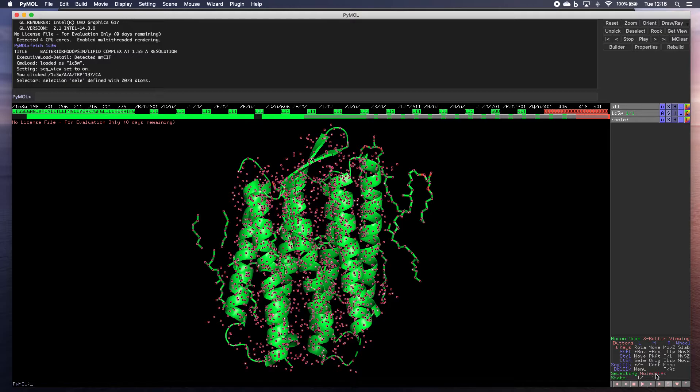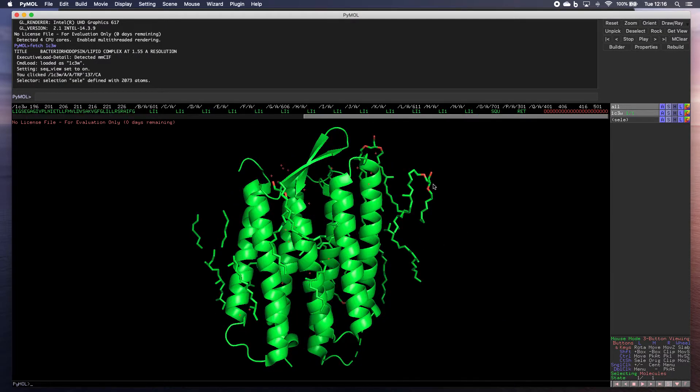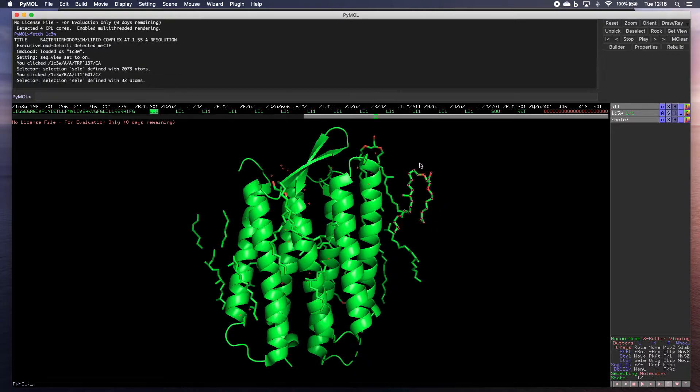Now we could alternatively click on molecules. So click off to deselect, then click on that one. And now it's just selected that particular molecule.